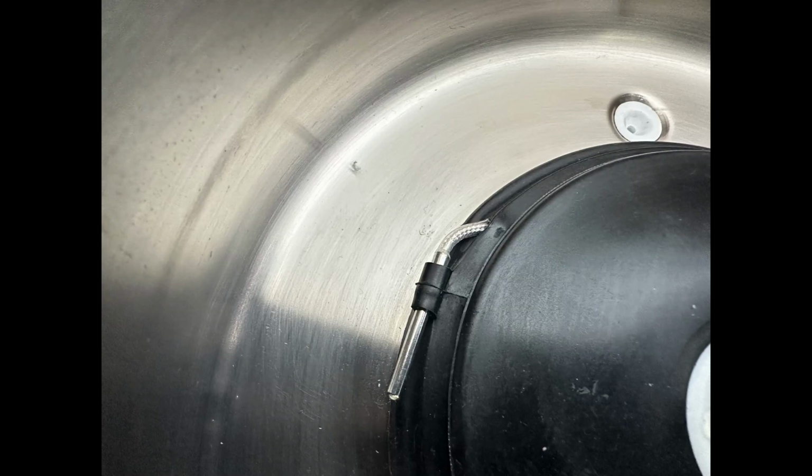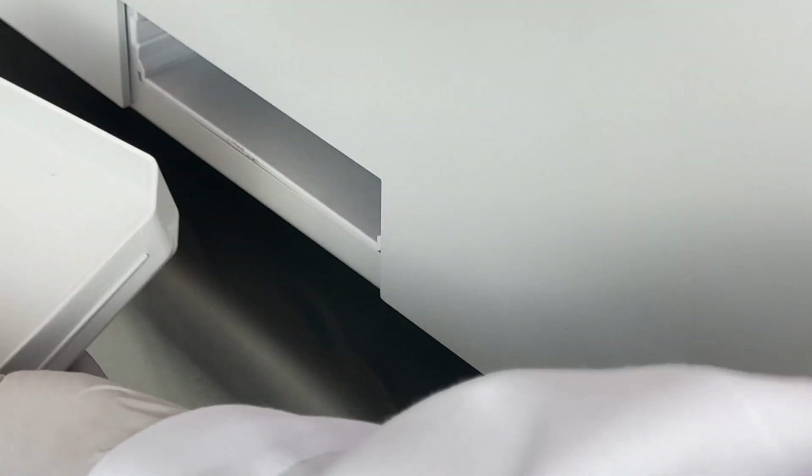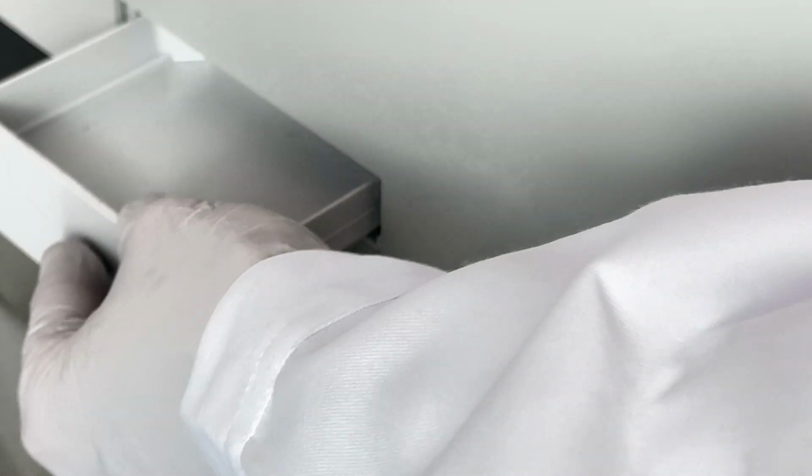Also in the chamber, you've got a very good quality braided PT1000 temperature probe, a drain hole for draining liquids out, and on the outside you've got a corresponding reservoir for that drain. It's not something that you see a lot of in the UK because we lack the humidity, but it's there for cleaning purposes. You can flush some chemicals around the chamber and it won't get into the motor.